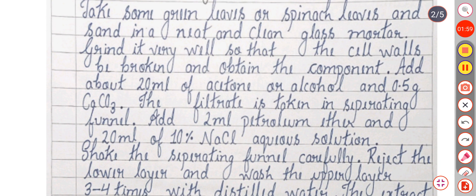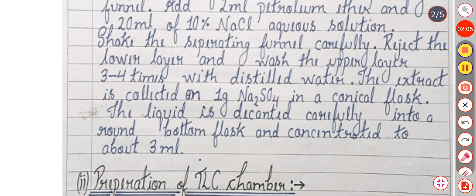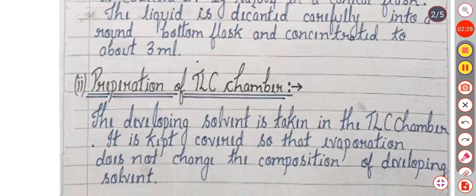Add 2 ml of petroleum ether and 20 ml of 10% NaCl aqueous wash solution. Shake the separating funnel carefully. Reject the lower layer and wash the upper layer 3 to 4 times with distilled water. The extract is collected on 1 gram Na₂SO₄ in a conical flask. The liquid is decanted carefully into a round bottom flask and concentrated to about 3 ml.